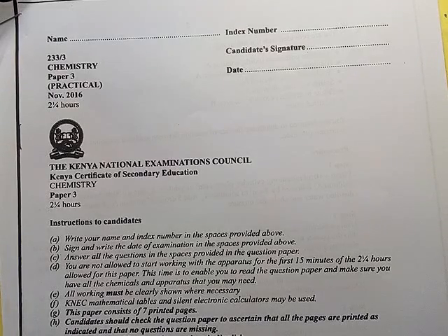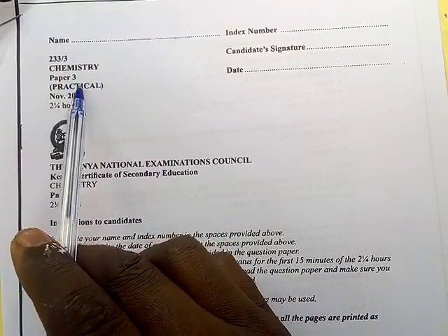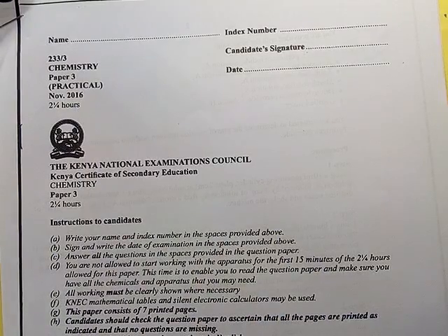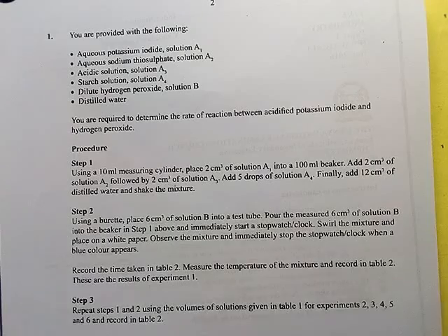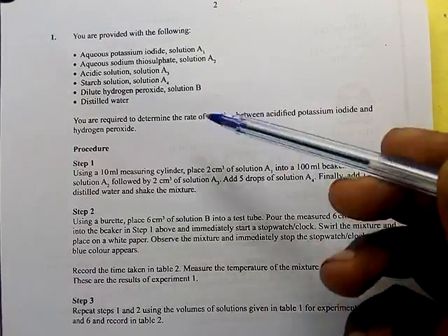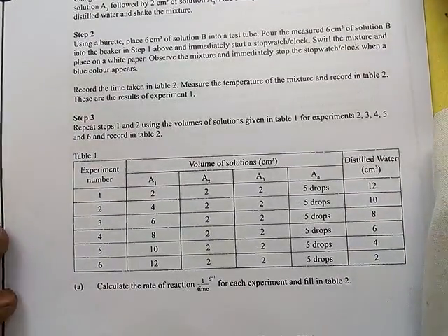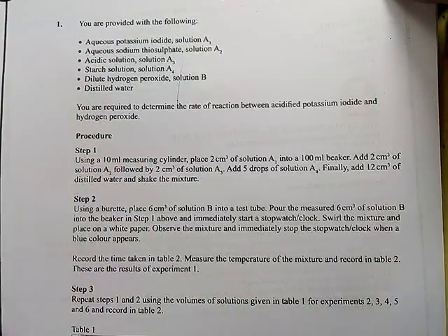Welcome wherever you are. I want to take you through chemistry paper 3 practical the year 2016. This is the paper that was done in the year 2016. This year there was no titration, so there was a lot of information that the students were given. They were supposed to carry out this experiment, which had the starch.